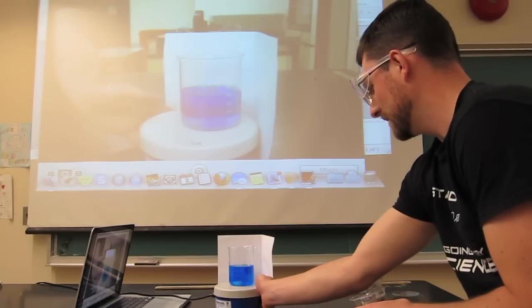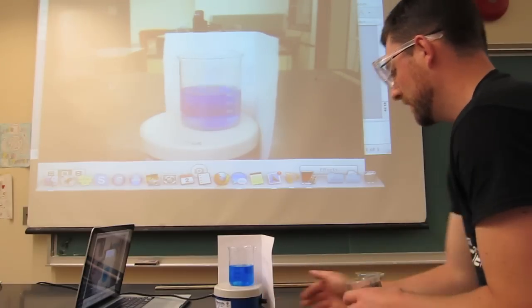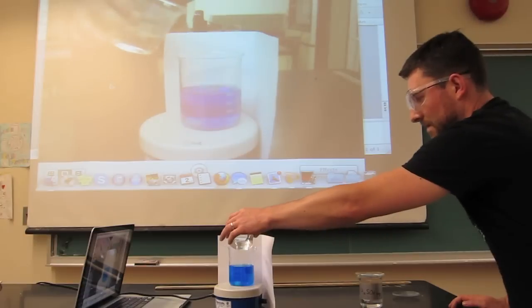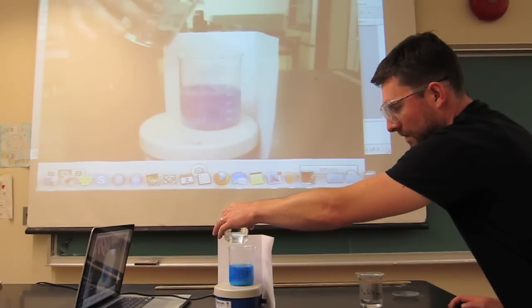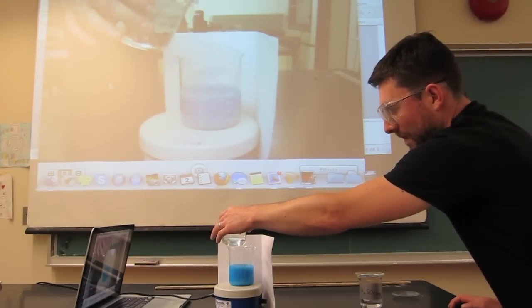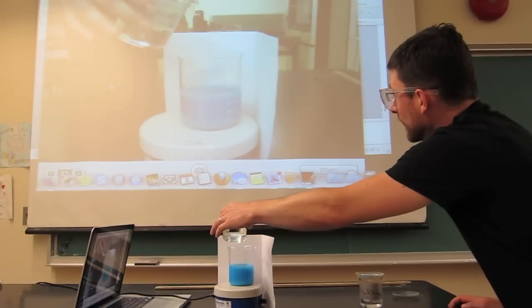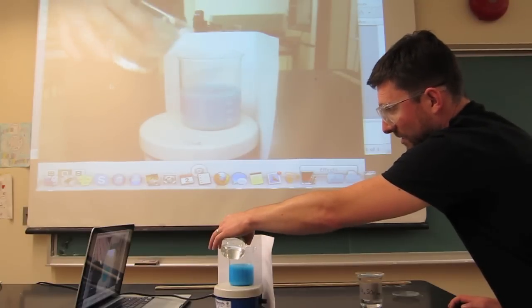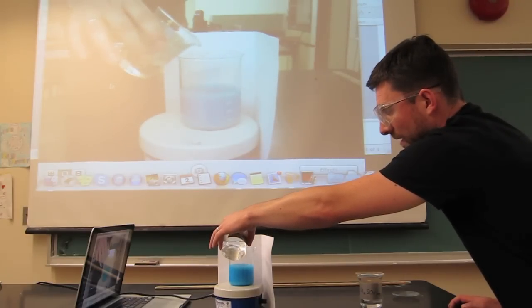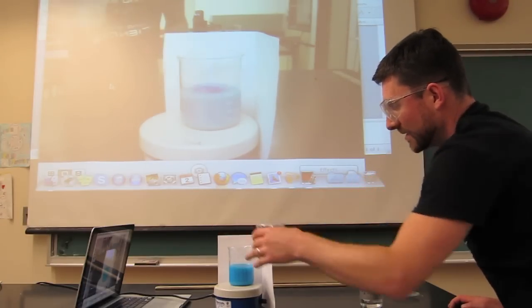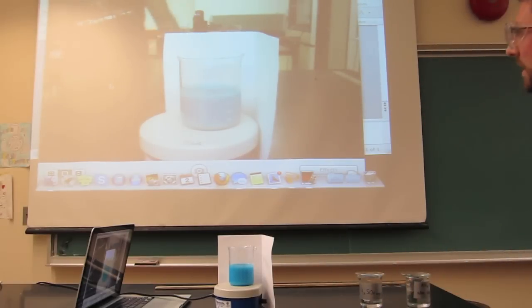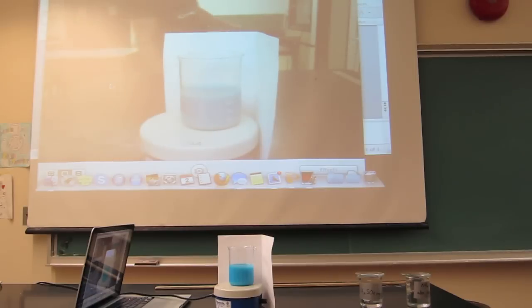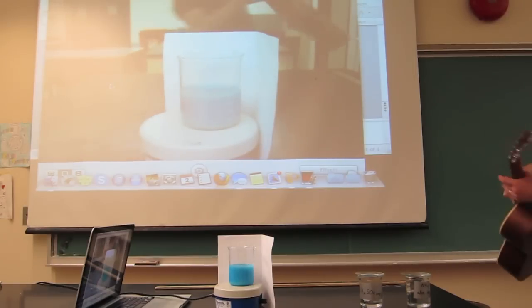Let's see what happens. You can see that the addition of a little bit of ammonium hydroxide actually causes that clear blue solution to turn into a light blue precipitate. So, that's just another shade of blue that copper II has to offer.